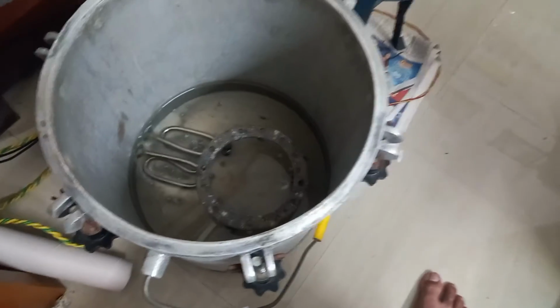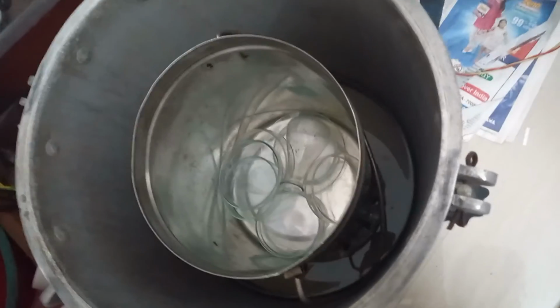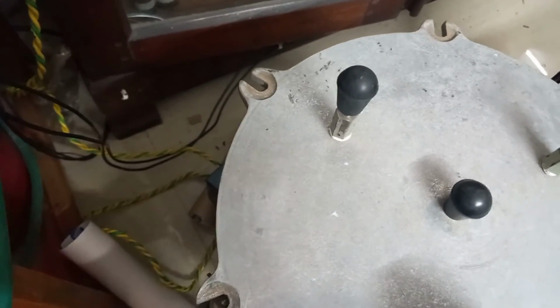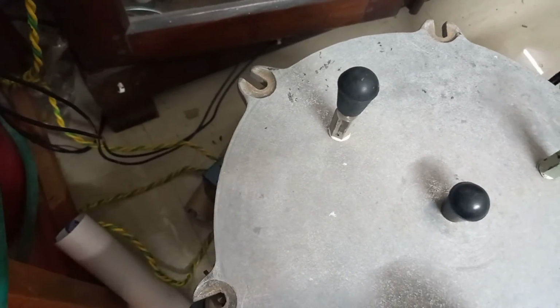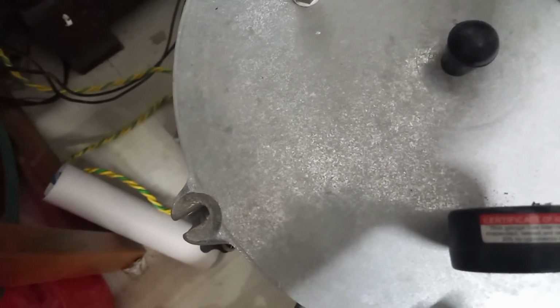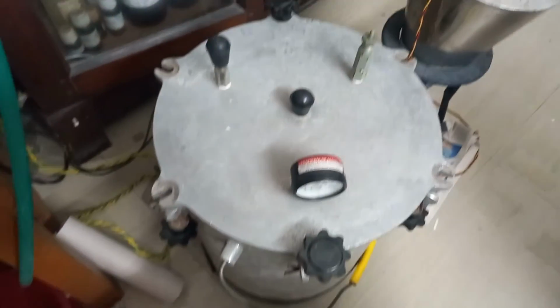When you keep the can inside, we are just going to put the top lid on like this. So here it is done. After that, one by one, we are going to place these knobs like that, and tighten them up in the same way.